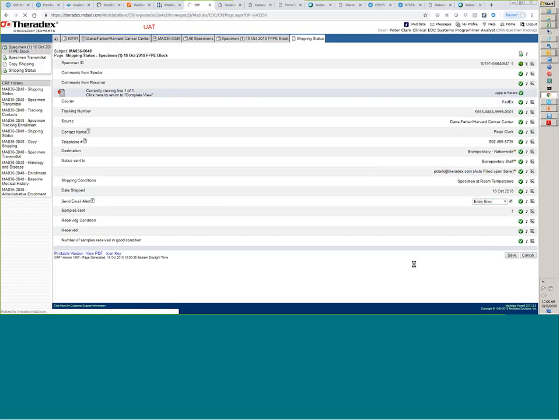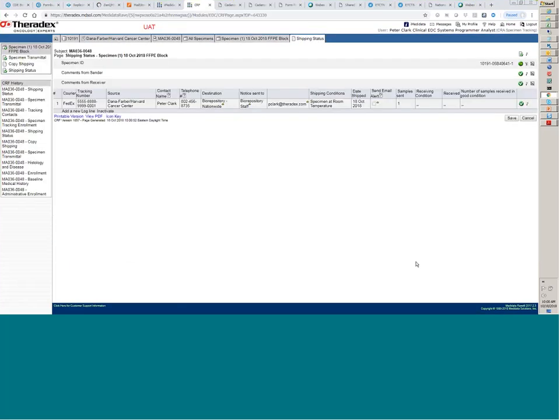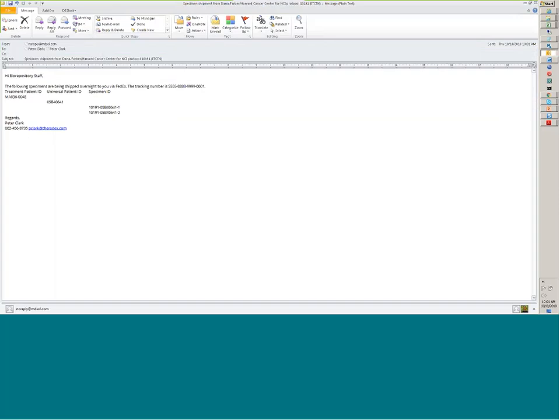So the email gets sent. You're going to print the reports, put them in the box with the specimen, and ship it out. You will get information back from the site that they did receive it. And so here I've gotten an email that's just come in.